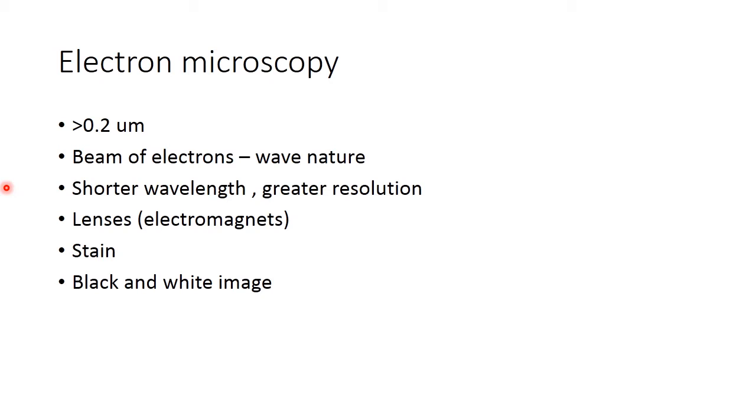So in case of electron microscopy, the staining agents are electron dense substances. Most of them are salts of heavy metals. Now, heavy metals are electron dense substances. So what is done is that the specimen could be coated with a layer of the salts of these heavy metals. Substances like silver, iron, gold, uranium could be used to produce a covering, a layer onto the specimen.